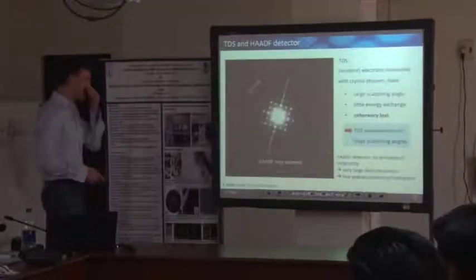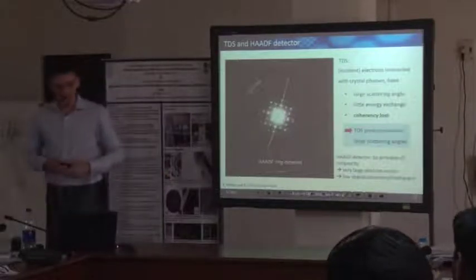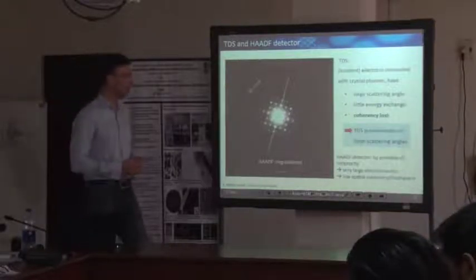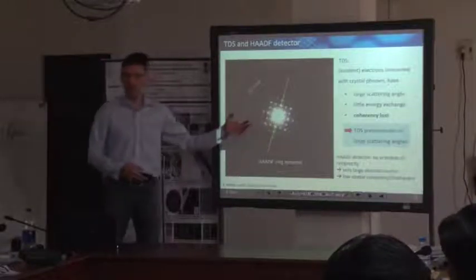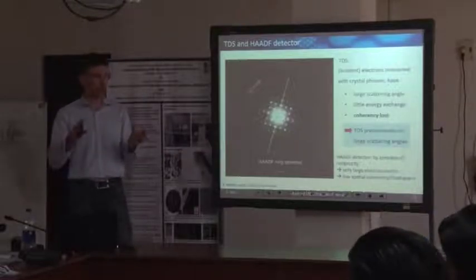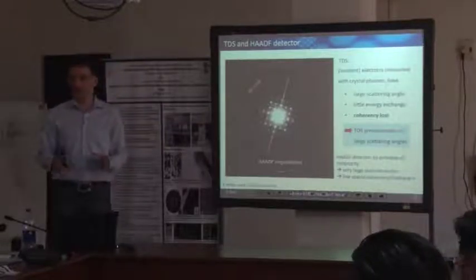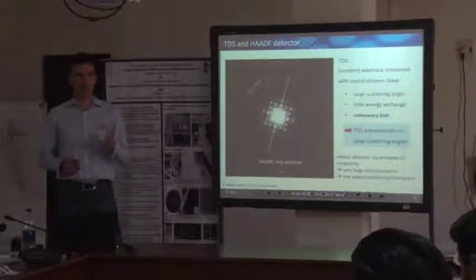Let me just come to this slide, because I would like to address which signals we record with our detectors. Because I mean, there's a lot going on. This is a diffraction pattern on axis, so this is a sample probably for atomic resolution imaging, so you would also have to deal with the alignment and the orientation of your crystalline lattice with respect to the incoming electron.